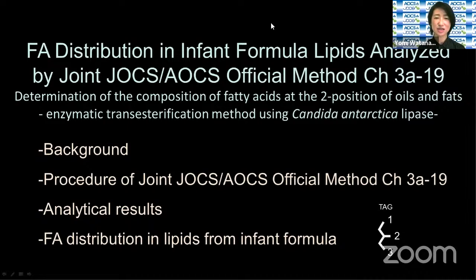Joint JOCS/AOCS official method Ch 3a-19, which was launched last year, is a method to determine the composition of fatty acids at the SN2 position of oils and fats utilizing enzymatic transesterification by Candida antarctica lipase. Let me give you an overview of the method first, and then explain the analytical procedure in detail. Then I will show you some of the results of testing vegetable and animal fats and oils, and finish by showing the application of the method to analysis of the lipids from infant formula.